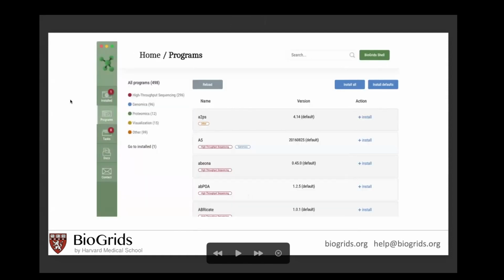And when that works and you're done, this is what the graphical installation manager looks like overall. And I'll open this up in a live demo in just a bit, and we can have a look at it and see how it works. The SBGrid installation manager is the same code underneath. It's the same program with a different badge.